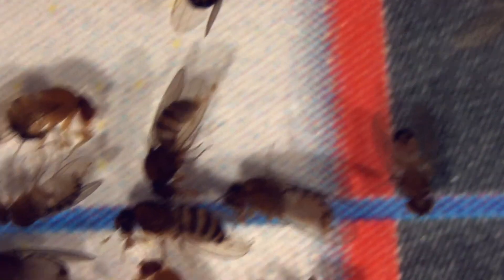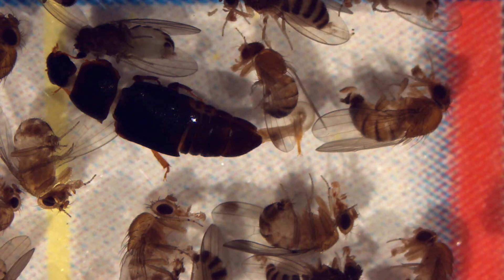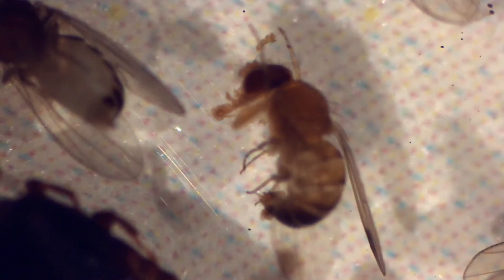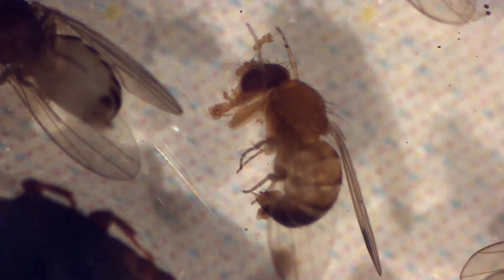I continue searching. There is the boundary of the first quadrant — now I move down. In this frame I can see a female on the right and a male at the bottom, and a male at the top. Give it a poke and take a look. At the top you'll see those two spurs on the front leg. Definitely a male.